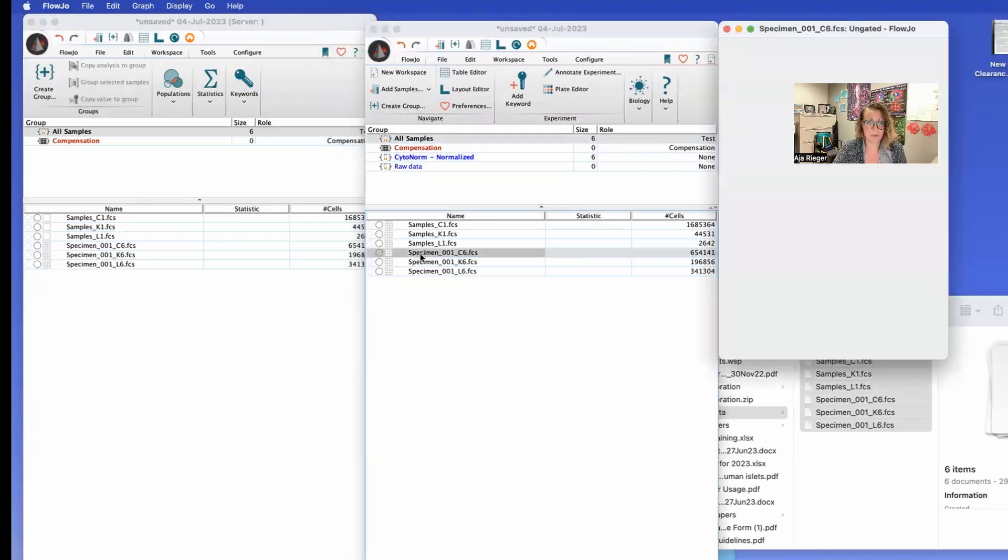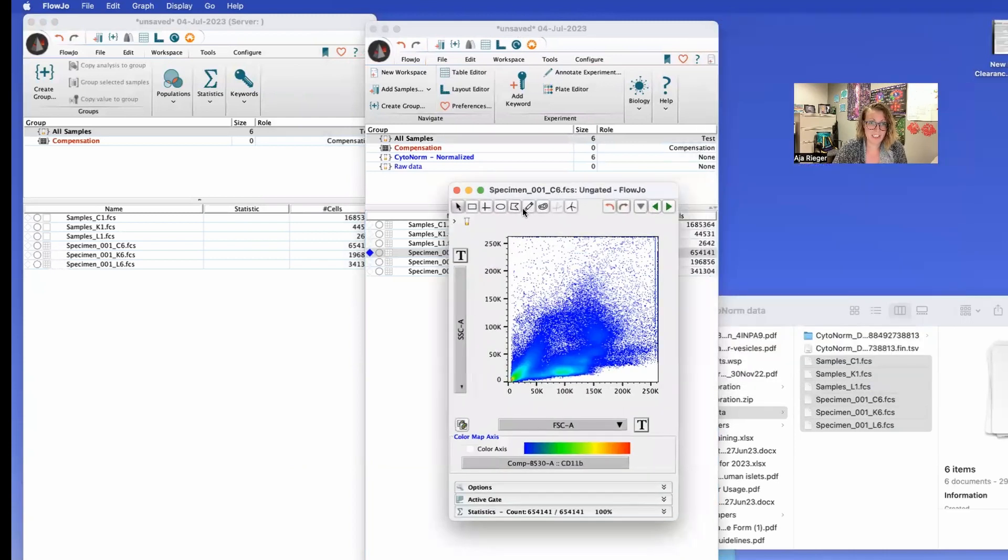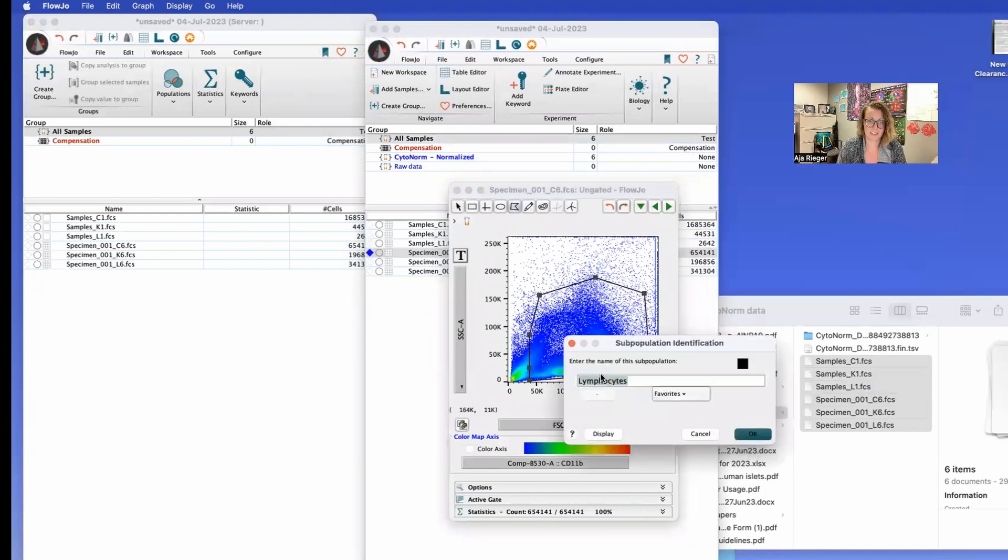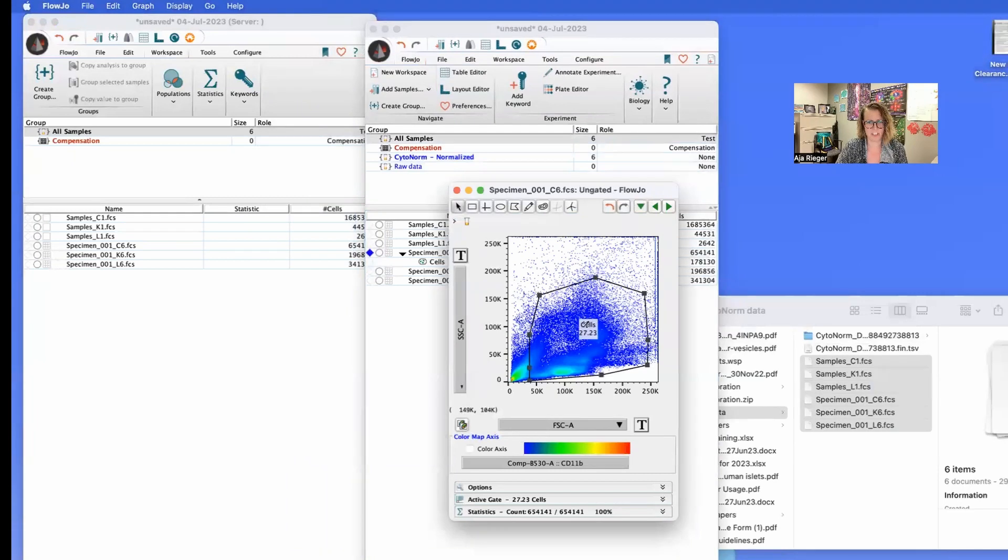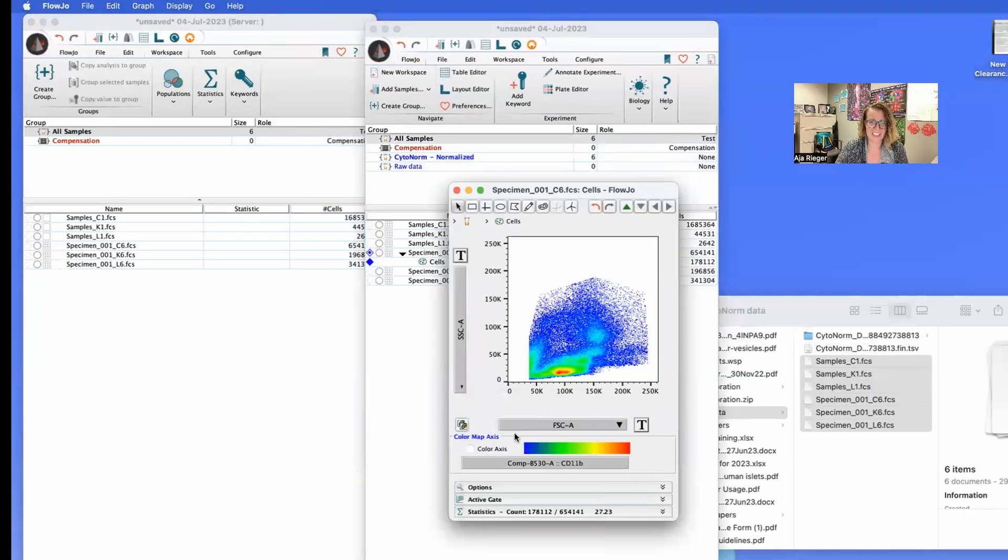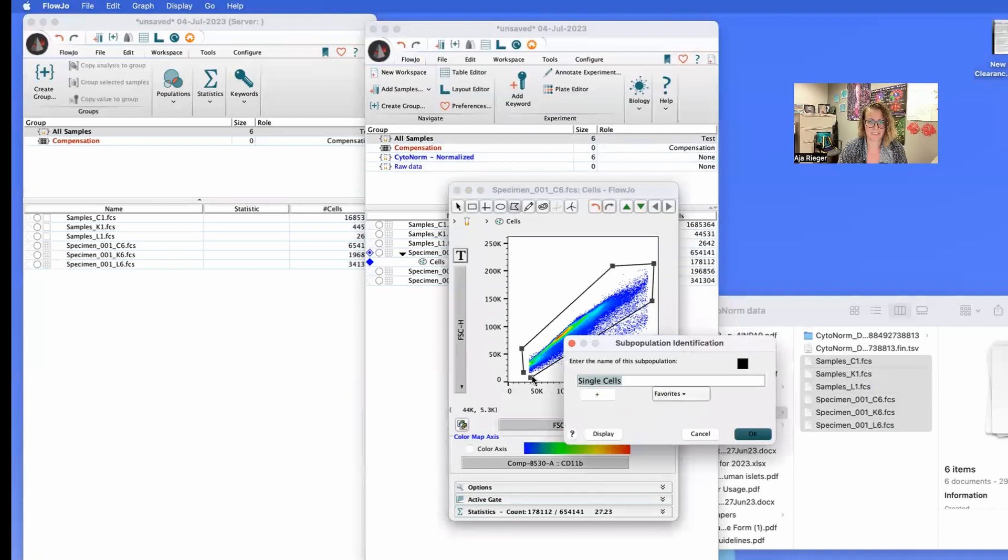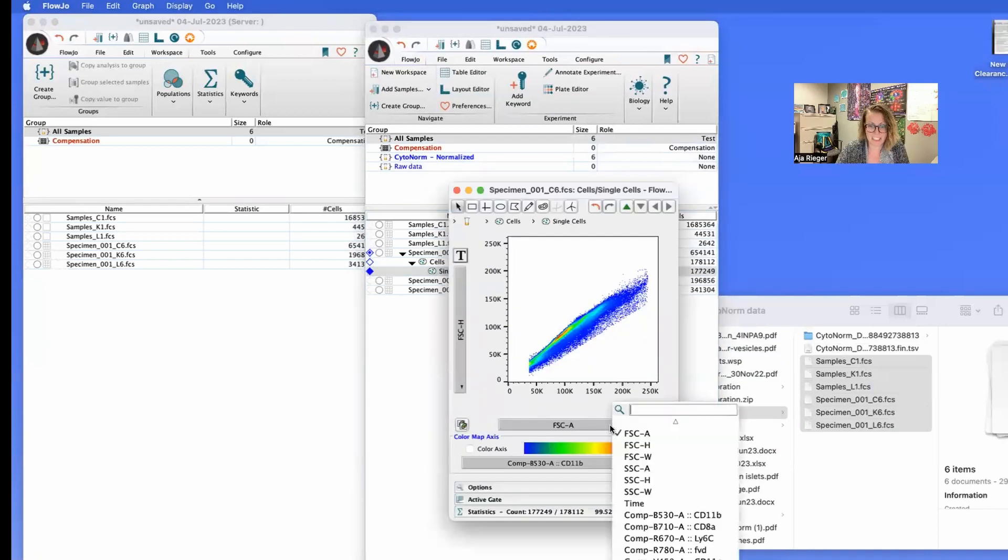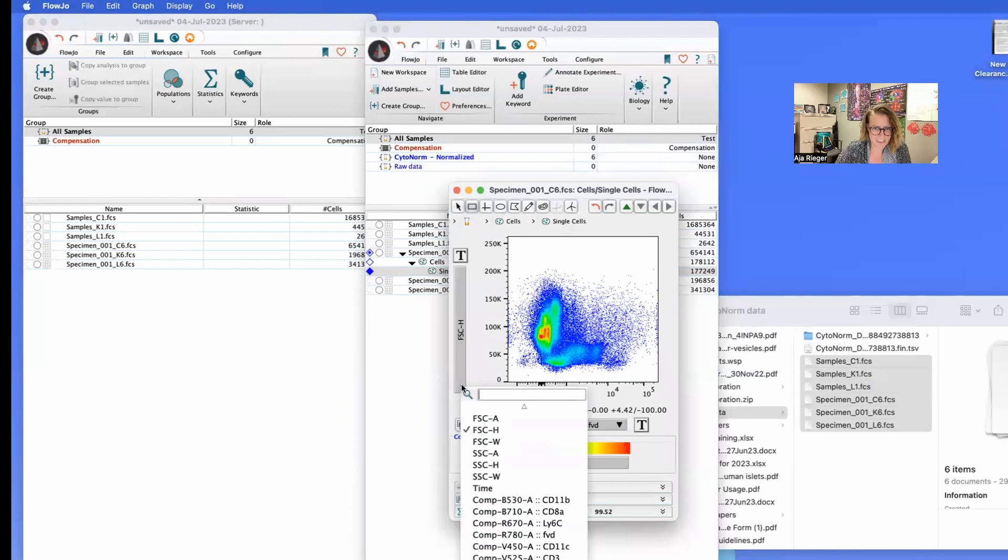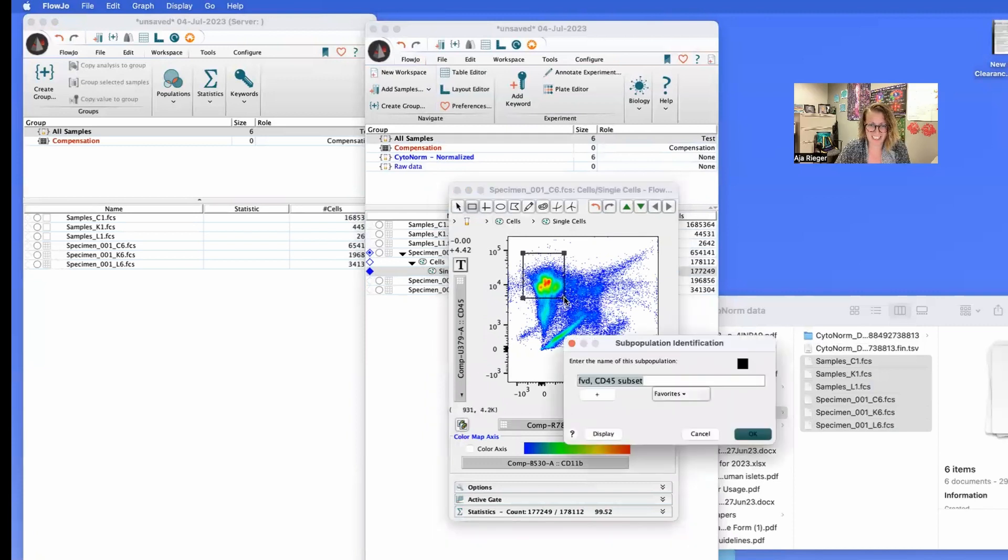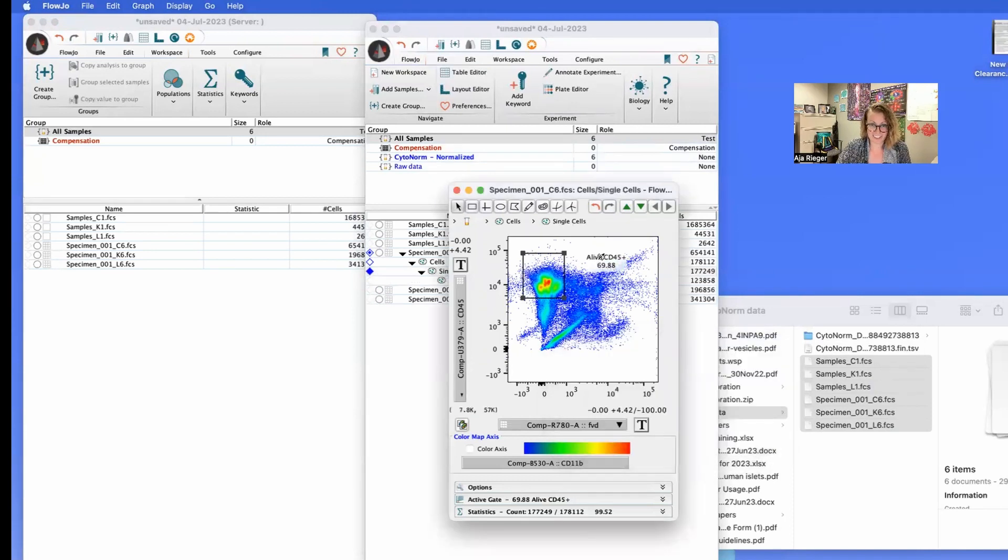All right, so when you open this up, right away you can go in here and gate like you normally would. Get our cells, go in here and do our single cells. And then we'll go in here and let's get rid of our dead cells. Actually, let's do with the CD45 in there. That looks a little ugly, but that's OK. That's just how these samples looked. Alive CD45 positive. Don't always get nice looking samples as a core manager.